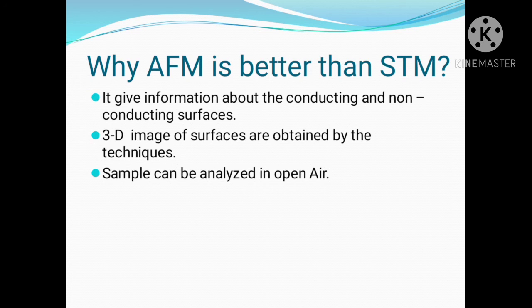Why is AFM better than STM? It gives information about both conducting and non-conducting surfaces. 3D images of the surface are obtained by this technique. With this technique, the sample can be analyzed in open air.